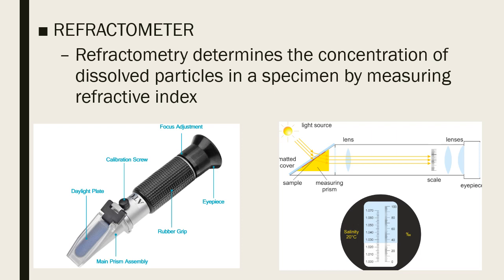And so this one is an illustration of your refractometer. You have here your sample plate. And here, that is your eyepiece. Okay, and so this is your eyepiece, the part where we look through. And this is where you place, of course, your sample, your specimen. Okay, and then of course you have here your scale as such. Okay, so you have there your refractometer.